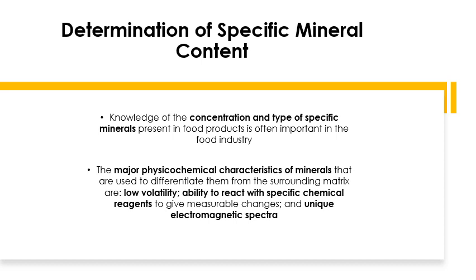The good thing is that the major physical-chemical characteristics of minerals can be used to differentiate them from the surrounding matrix. A few of these characteristics involve low volatility, the ability to react with specific chemical reagents to give measurable changes, and also their unique electromagnetic spectra.